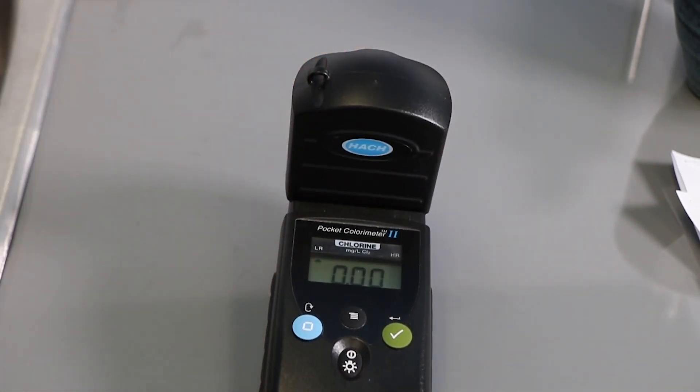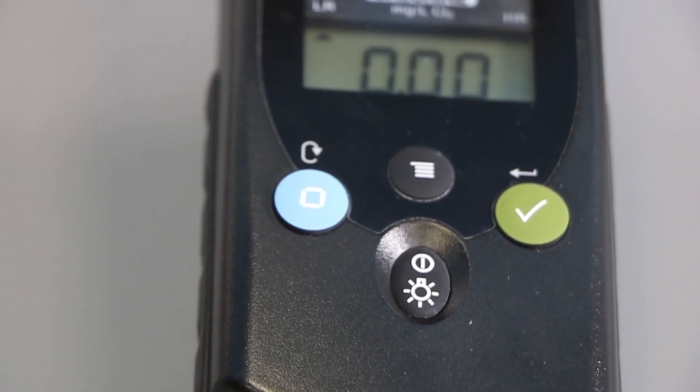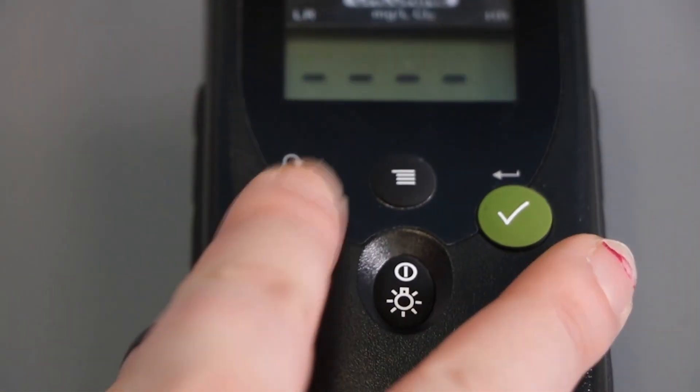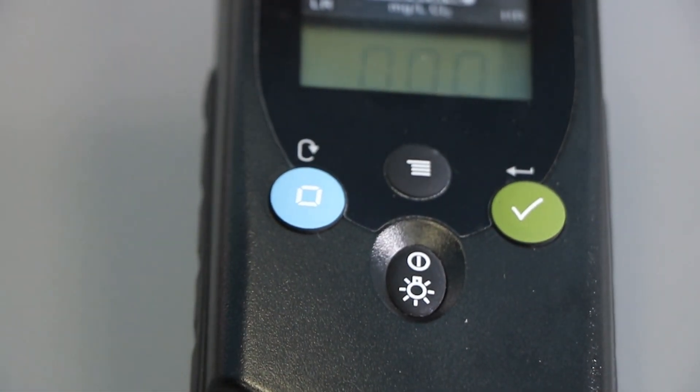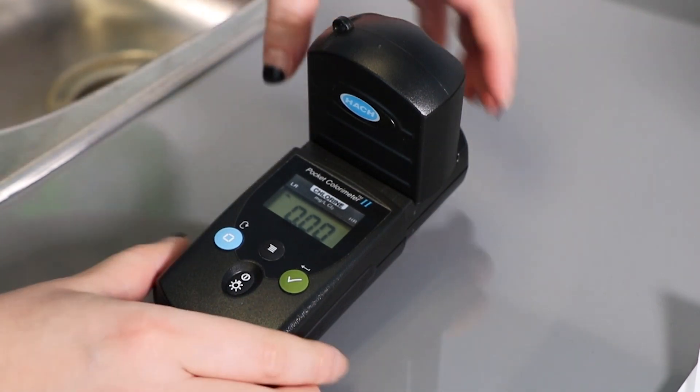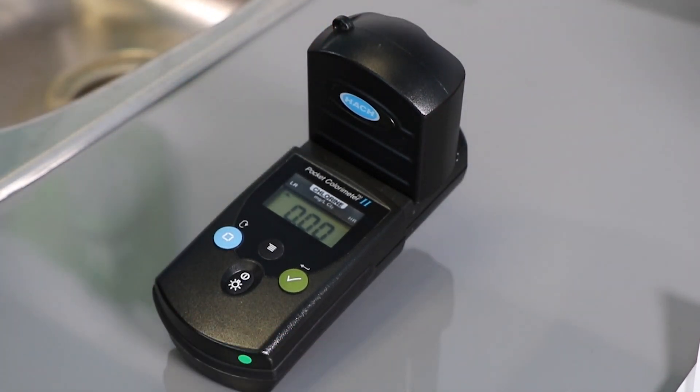Press the zero button. The counter should read 0.00. Chlorometers are zeroed or blanked to account for any background color in the sample that may impact the chlorine residual reading. For an accurate chlorine residual reading, don't forget this step.